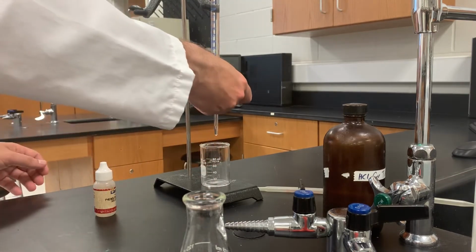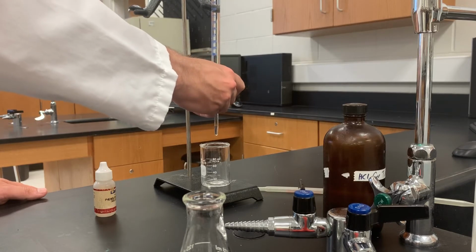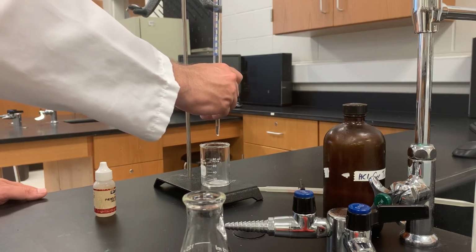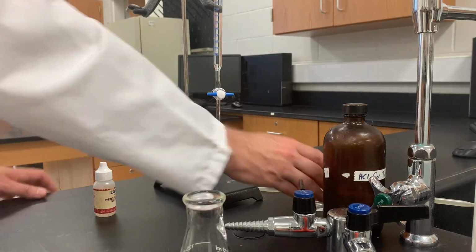So I need to open the stopcock, let some liquid flow through, to get the air out of the tip, and also to get the burette centered exactly at 0. And let me help you see that. The burette is right on the 0 mark.